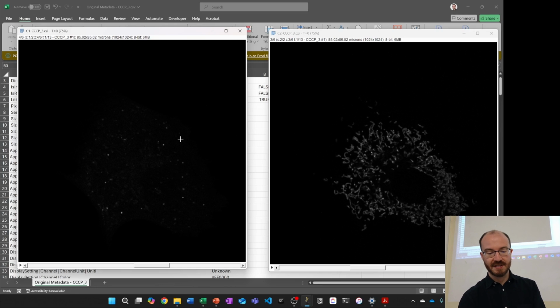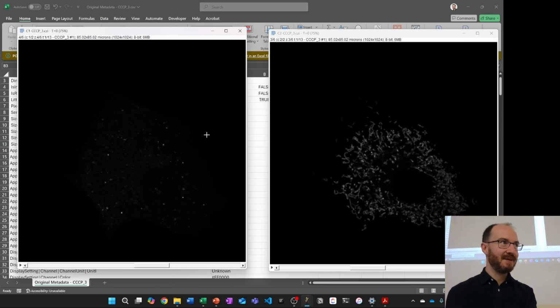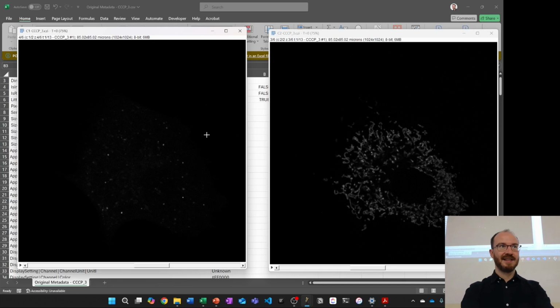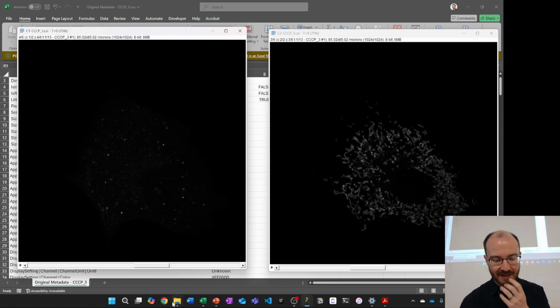Okay, so these two images, which I showed you how to get, I was pretty quick, but I've given them to you in the folder as well. So these two exact images you're seeing in front of you, you don't necessarily need to get them. I've quickly shown you how, but you can just open them up directly in Fiji.